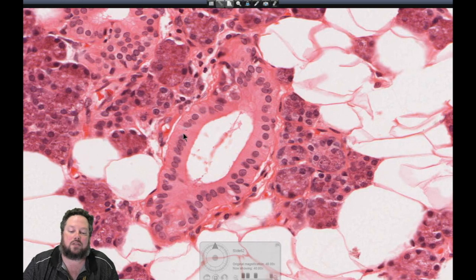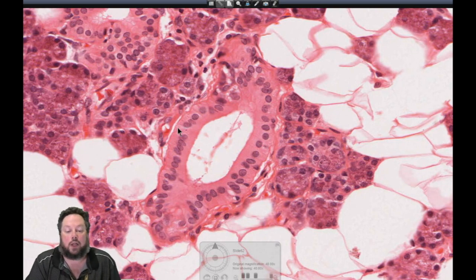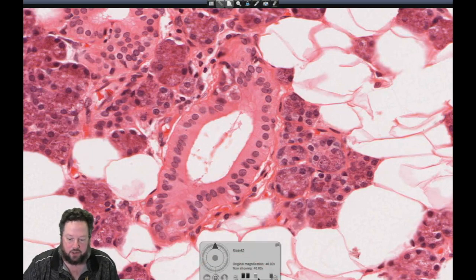So they're actually a means of having an increase in surface area of the cell membrane at the basal surface so that you can have more ion channels and things like that. And interspersed between those membranous infoldings, we often find mitochondria, which are powering the ATPase ion channels to move substances against a concentration gradient. So mitochondria have lots of membranes, they have lots of enzymes, and they're quite acidophilic, and that accounts for the stripy nature at the base of some of these striated ducts.